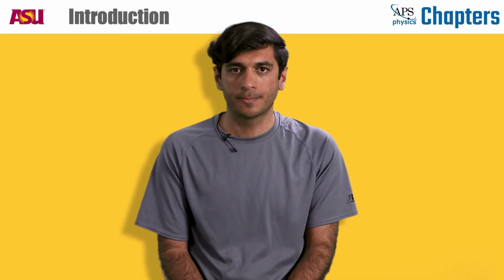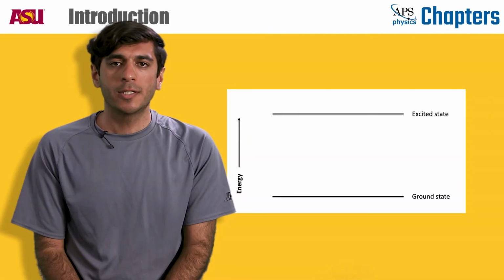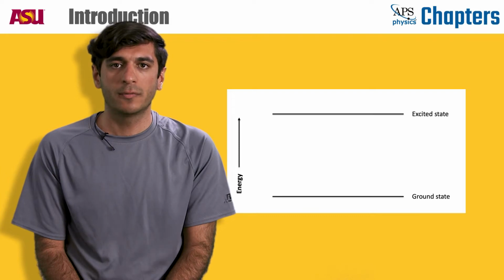Today, I'm going to talk about one of our recent published papers on fluorescent lifetime imaging, in collaboration with the labs of Professor Digman and Professor Gratton, with the title High Resolution Fluorescent Lifetime Maps from Minimal Photon Counts. Here, I will explain fluorescent lifetime imaging microscopy, otherwise known as FLIM.